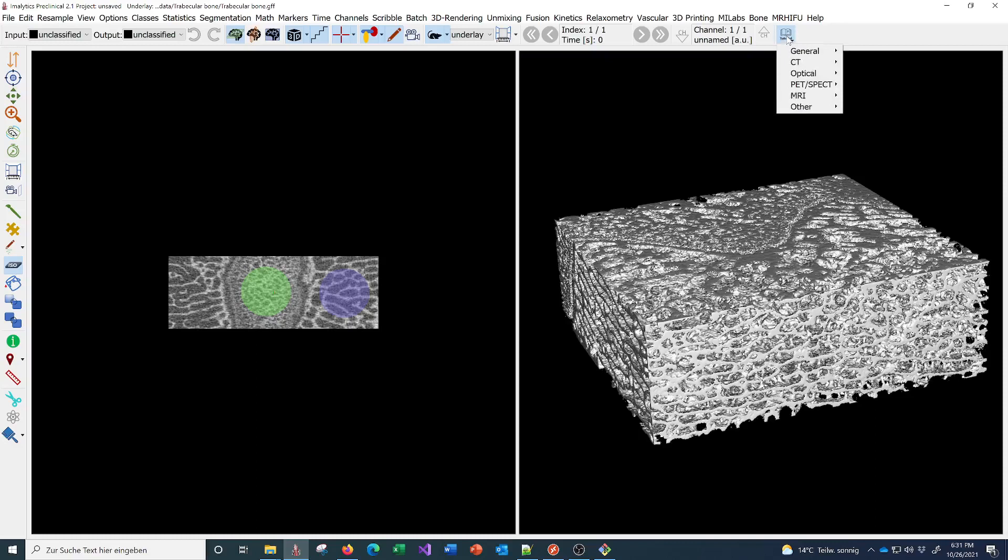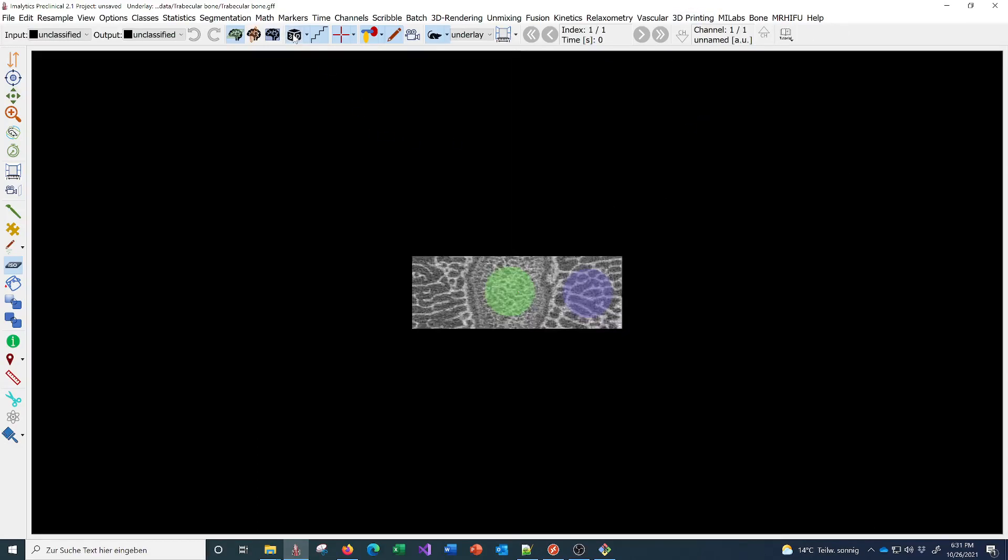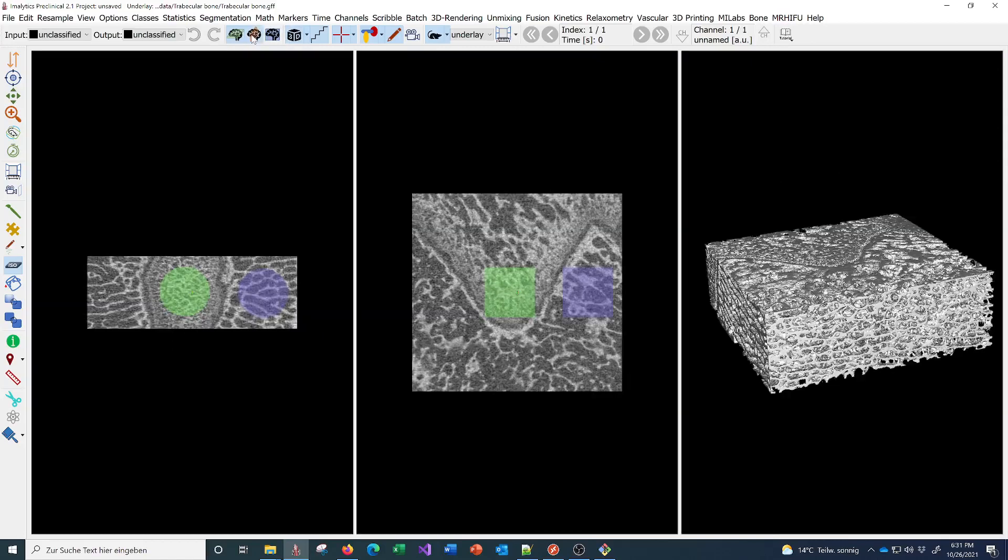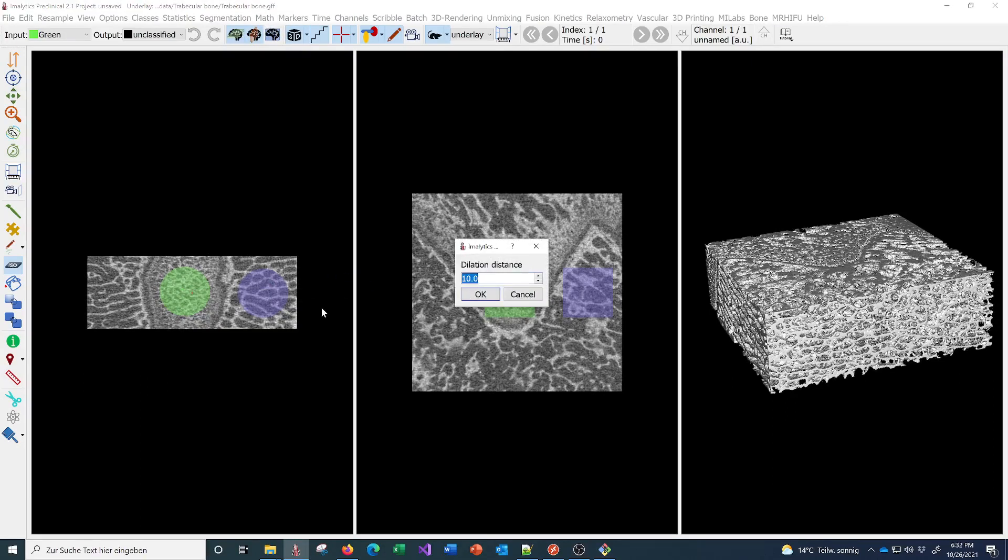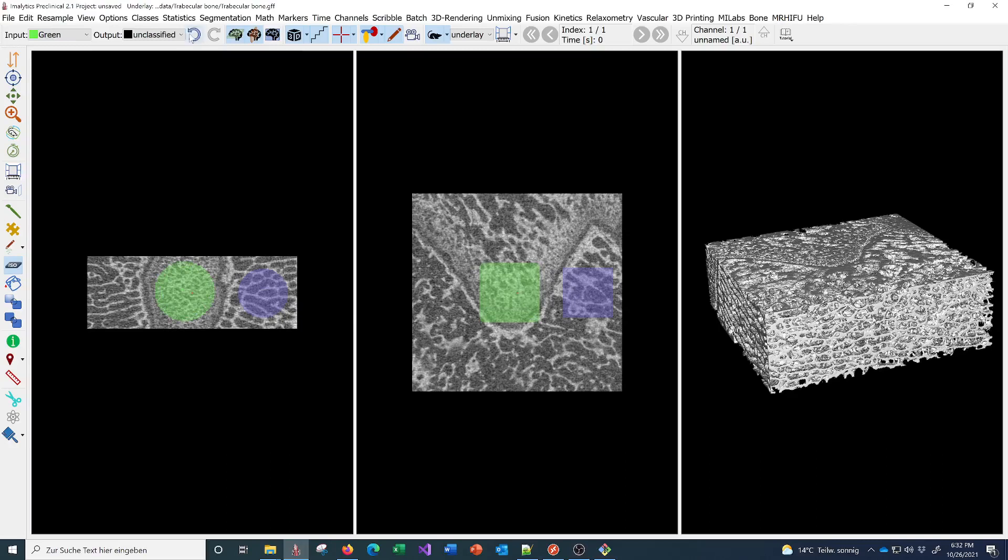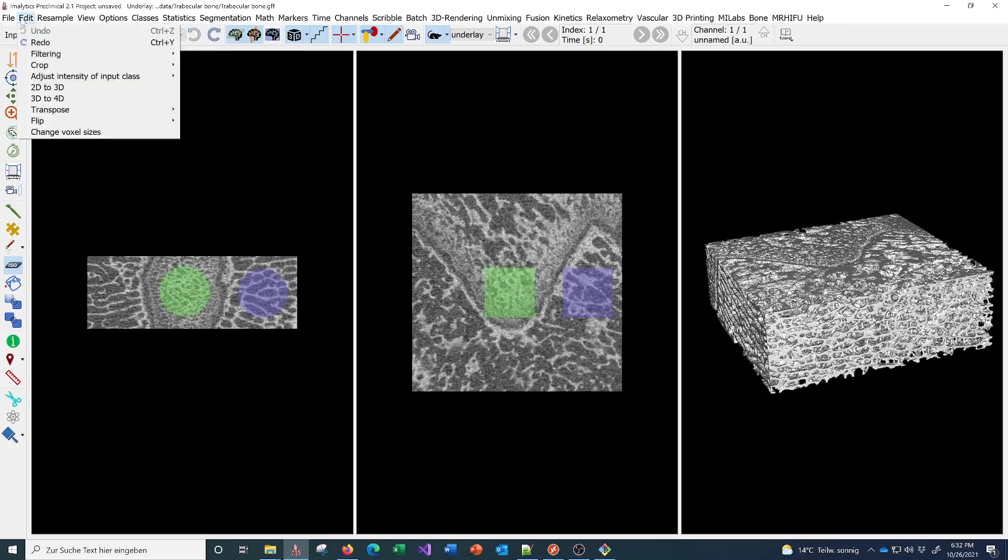You can learn all that in these tutorials. To give you an overview, you can turn on 3D view, turn on different slice views. If you do a segmentation operation, let me just dilate this class here, make it bigger. You can undo that.